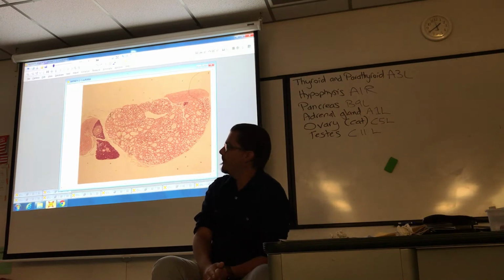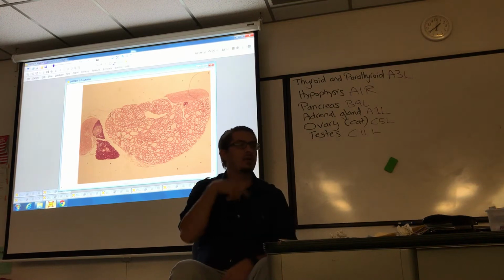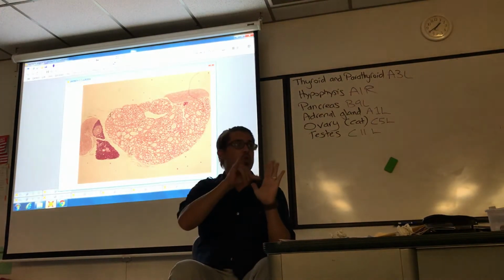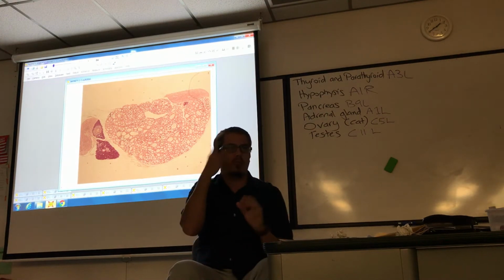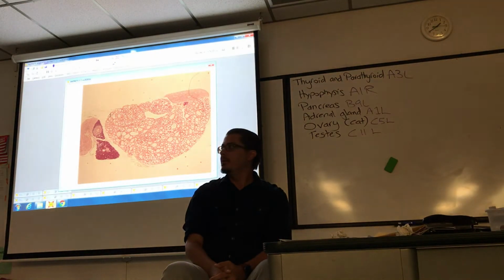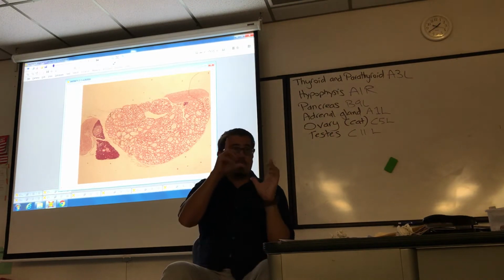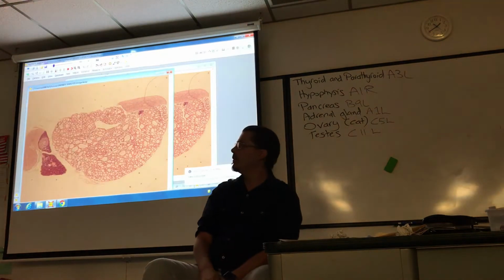Now, students always ask me, can you label the slides for us? Well, no, but I will teach the slides. And I am recording this, and I will upload to YouTube. And if you want to look at other resources or you don't know where to go, you can come to me, and I'll tell you what to study. But you're going to be given any picture I take. I'll take this picture. Boom. I'll post them later this afternoon when I'm in my office.